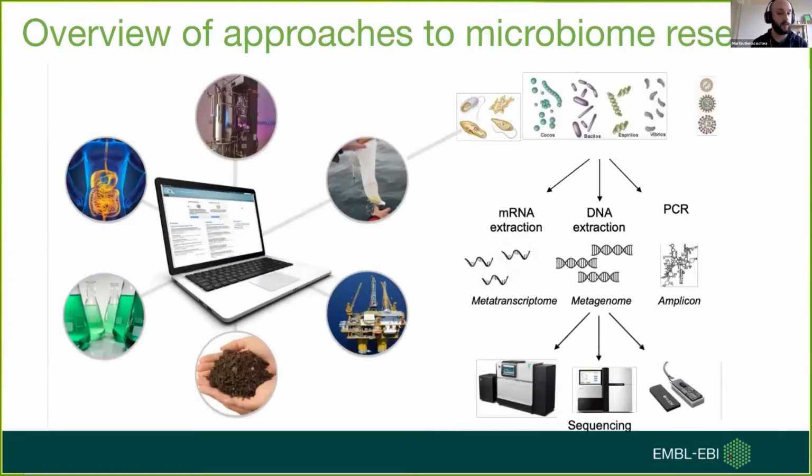First, I would like to say that metagenomics is a really broad term that has been used for many different things, but basically it's trying to understand the sum of the genetic material in an environmental sample. There are multiple reasons people may want to do that. For example, maybe the most classic example is trying to understand all the microbiota that lives in the gut of humans, because that has many different implications in human health and it's related to some diseases.